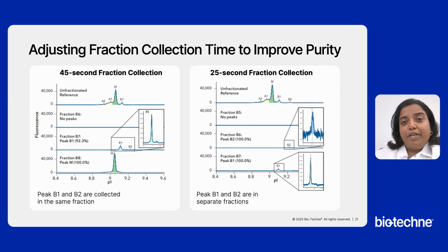The B2 and the B1 peaks for the NIST mAb were collected with increased purity using the 25-second fraction collection time, as verified when running the fractions on the Maurice icIEF using the 40-second fluorescence exposure. Charge variant percent purity is shown to represent the different fractions.